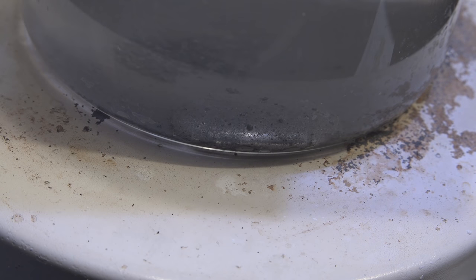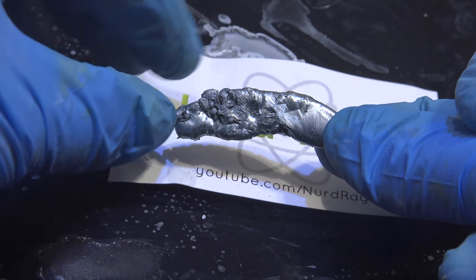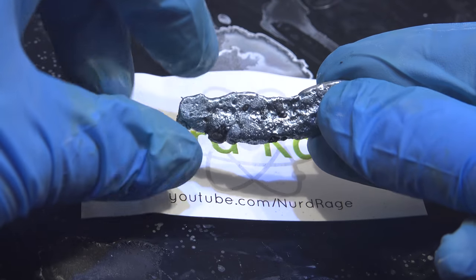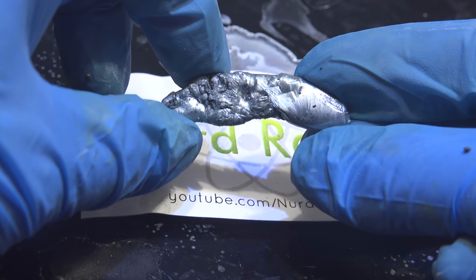Now turn off the heating and let it cool and solidify. And here is the gallium piece. For amateur uses this is sufficient and will behave like pure gallium for most purposes, although it is a bit dirty with embedded aluminum oxide bits.